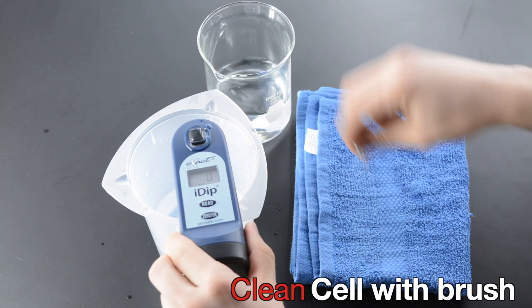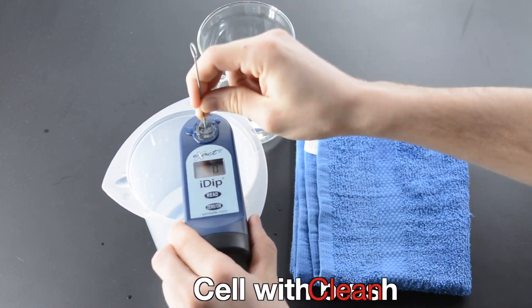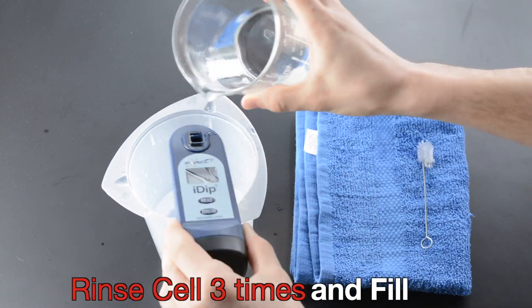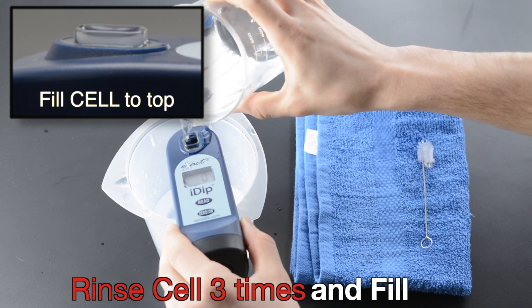Clean the cell with a brush. Rinse the cell three times and fill. Fill cell to top.